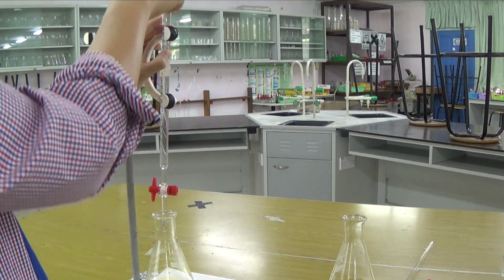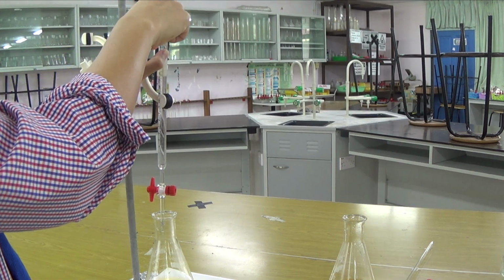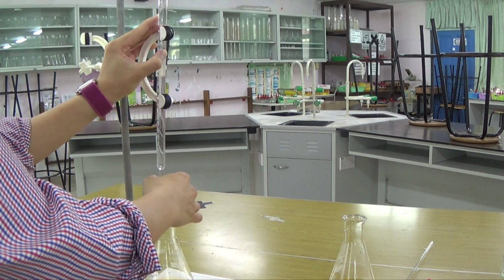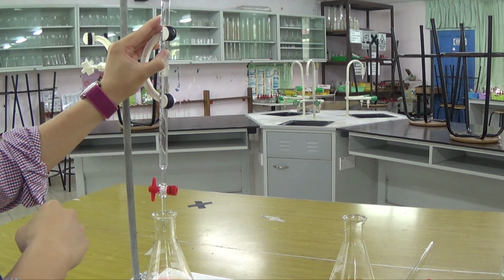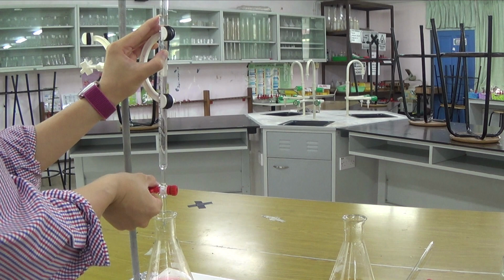Okay. So it's getting there. It's still going down, down, down. So we know it won't be in excess because we were being calculative. When it reached 30, that is when I will start to do it drop by drop from there and try to be exact from my second titration onwards.